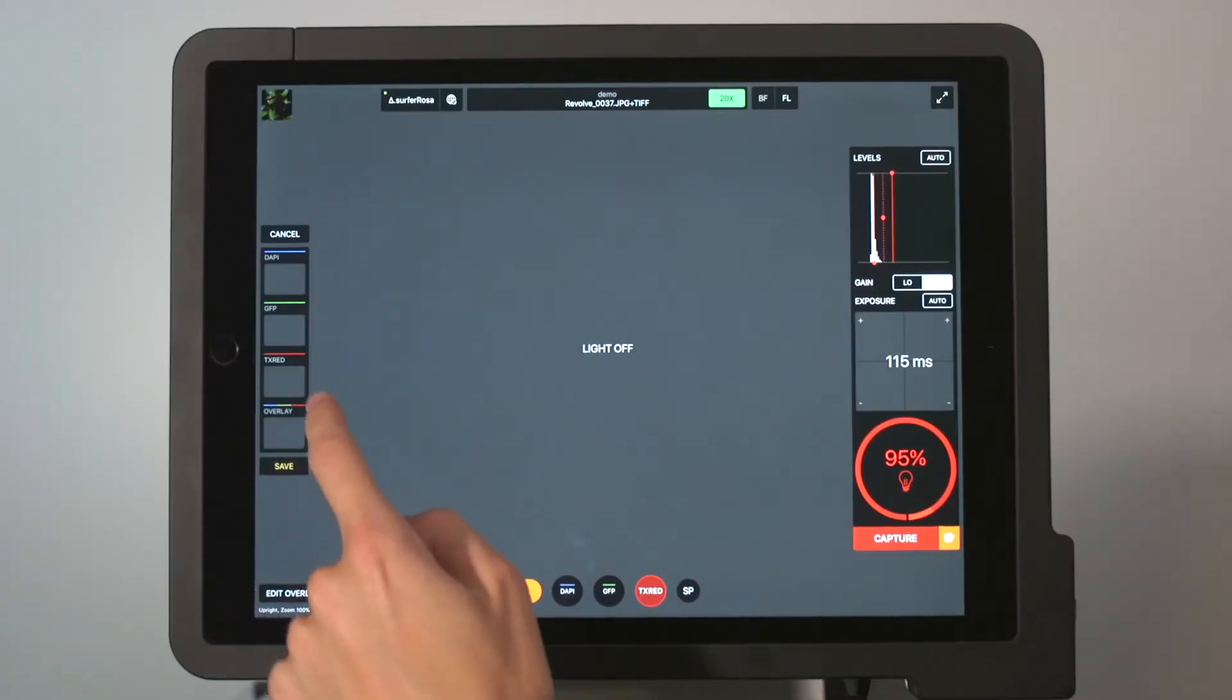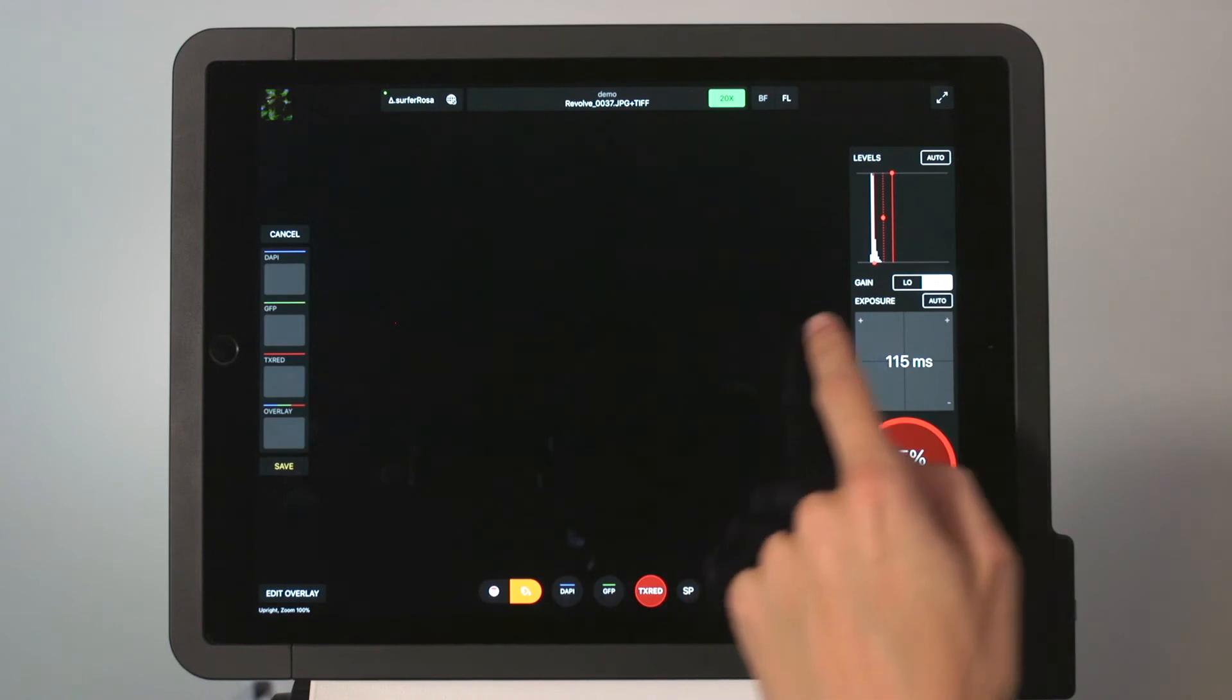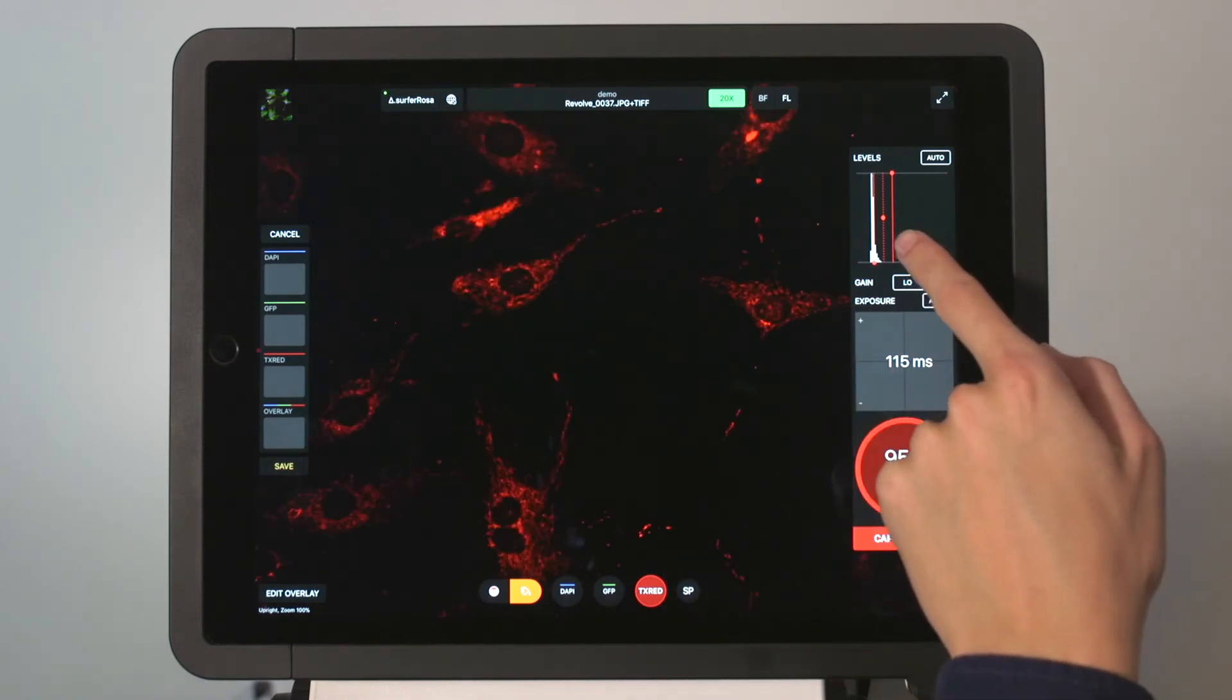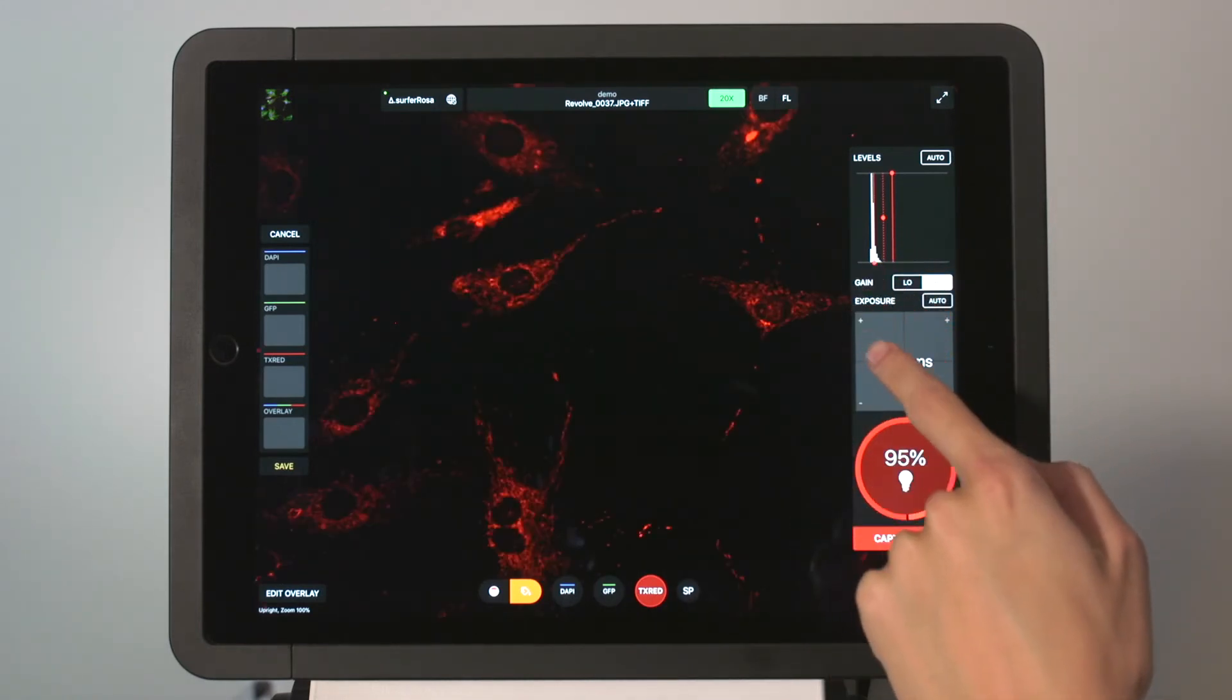On the right side, we can make adjustments to our histogram, exposure levels, and LED intensity.